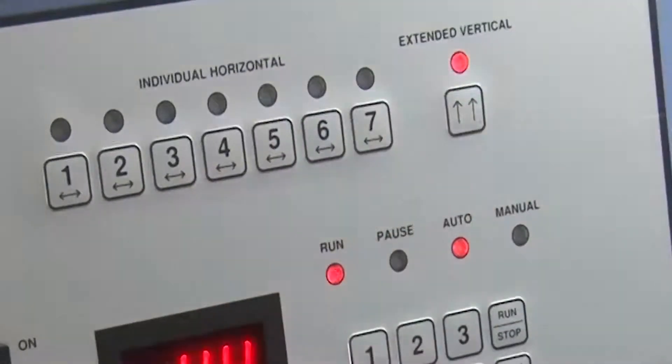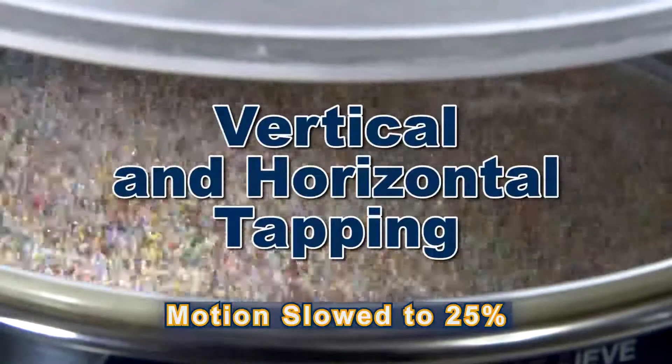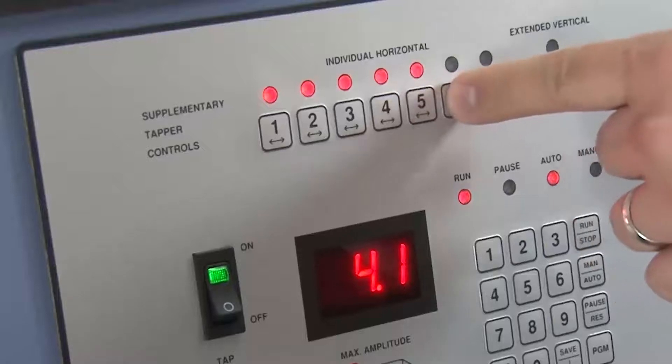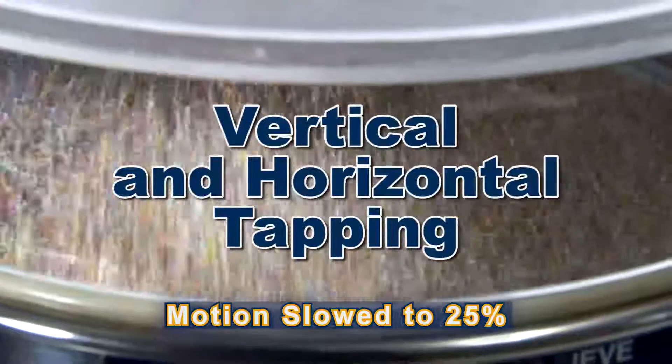The extended vertical tapping function provides greater up-and-down agitation, while the horizontal tappers can be individually actuated for specific sieves to assure maximum movement of hard-to-separate materials and to reduce bothersome sample clumping.